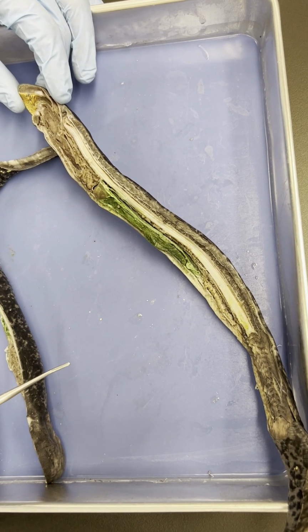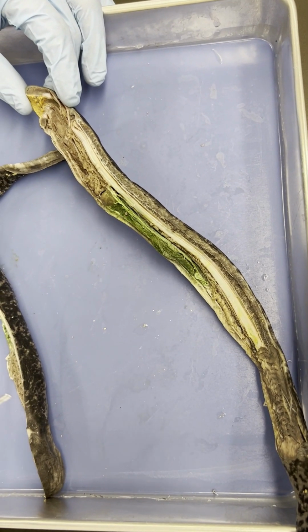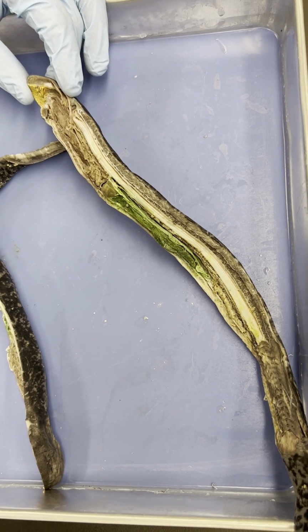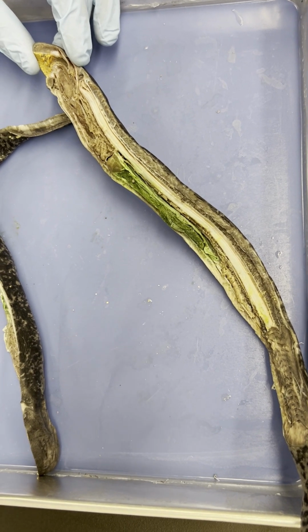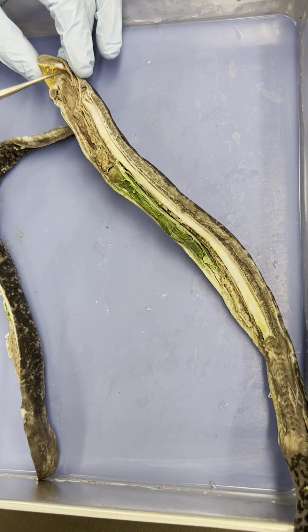Hey guys, so here we are with a beautiful sagittal cut done by Dr. Mick. I have my lab assignment to my right off screen that should be more or less the same that you guys actually have. So let's go over some of the structures that I'm seeing right now for the sagittal cut. You guys should know, here's the buccal cavity.